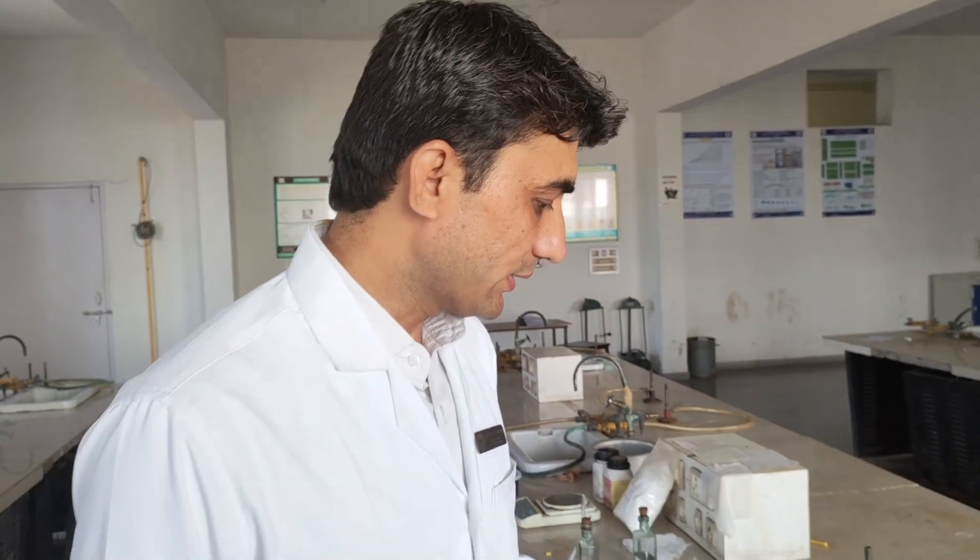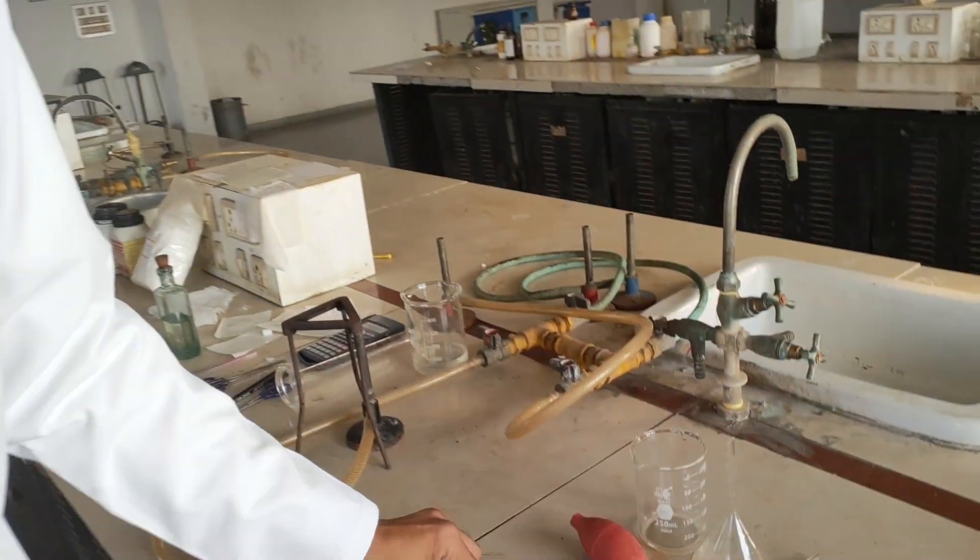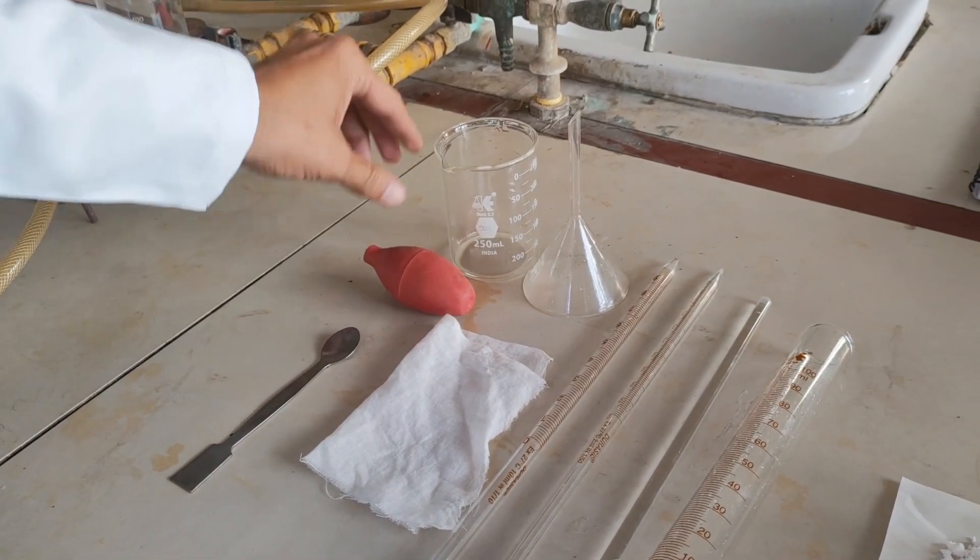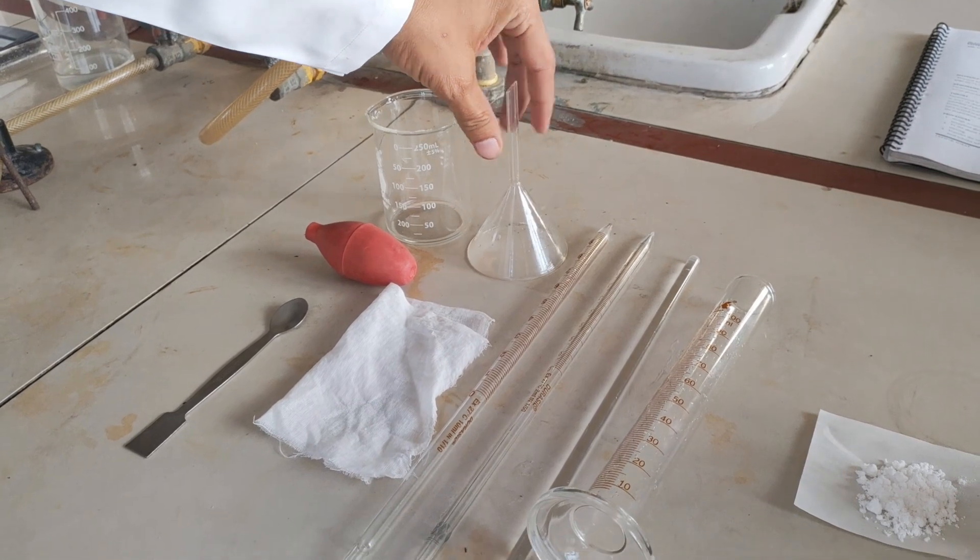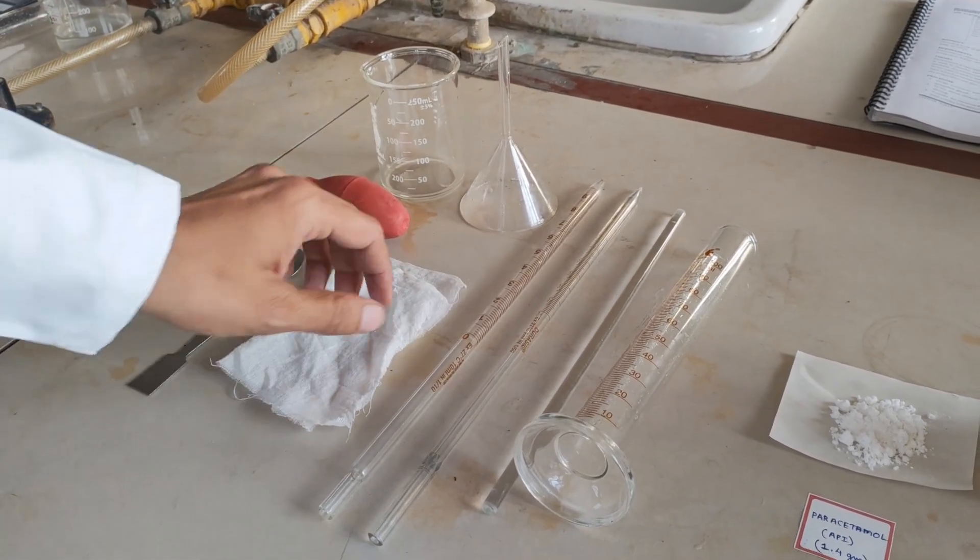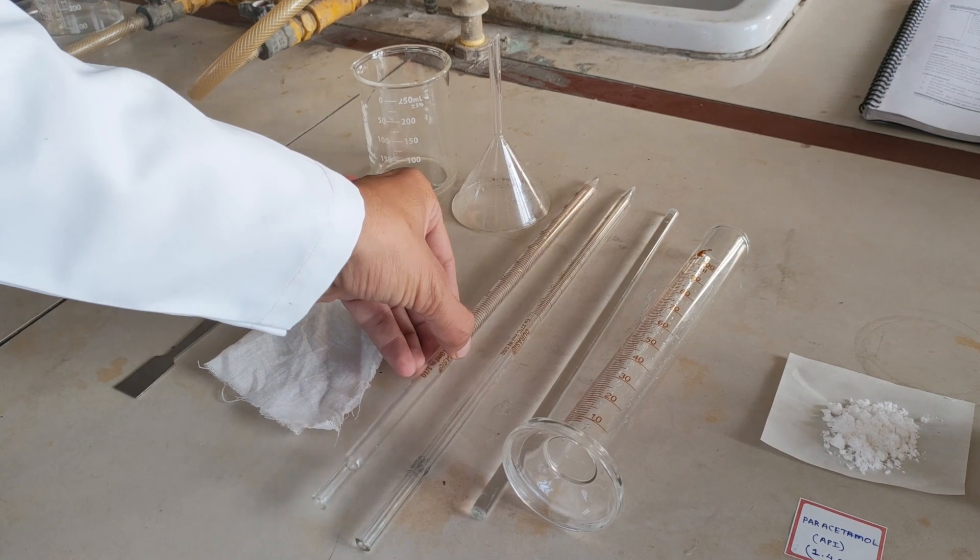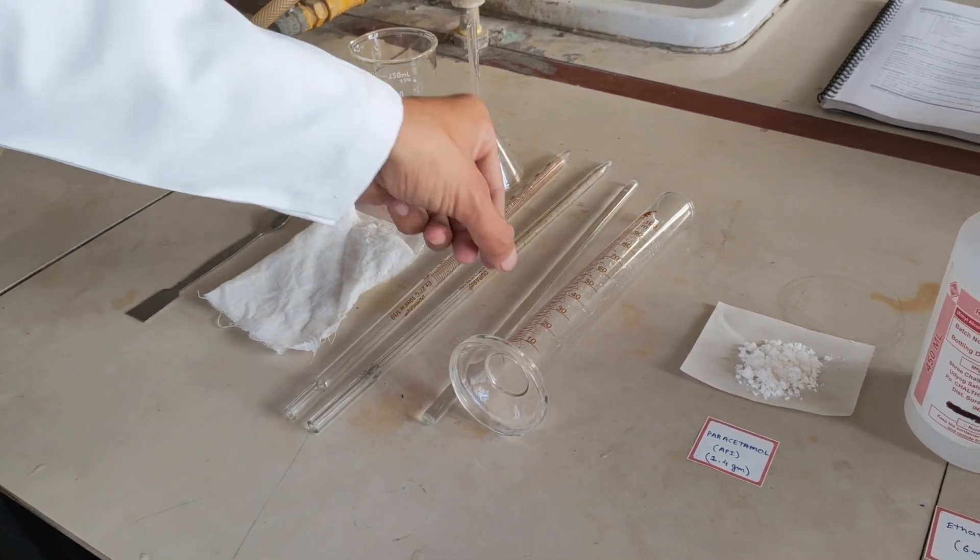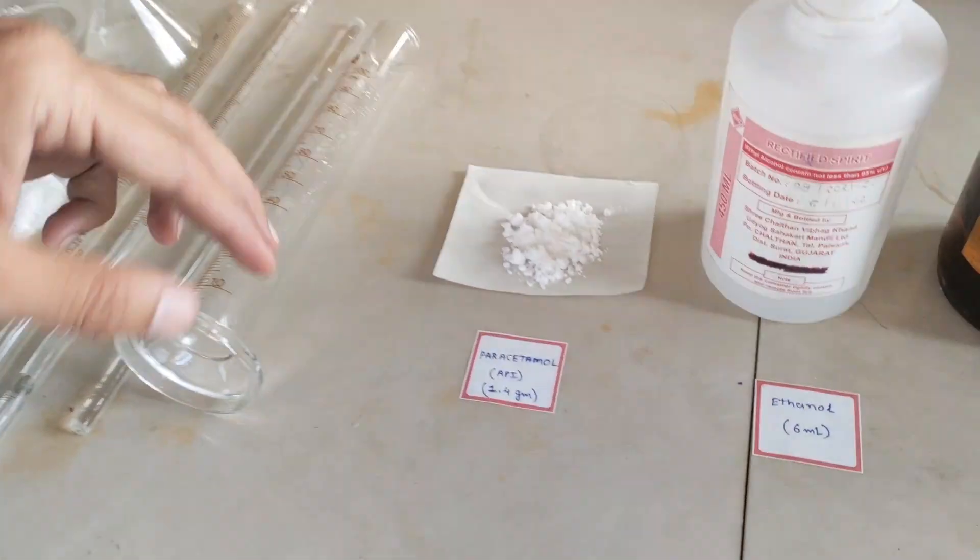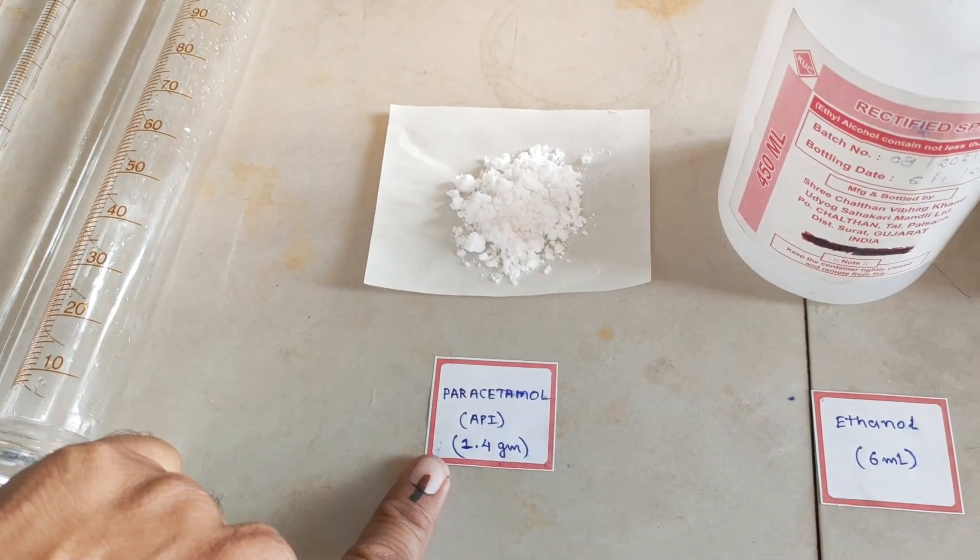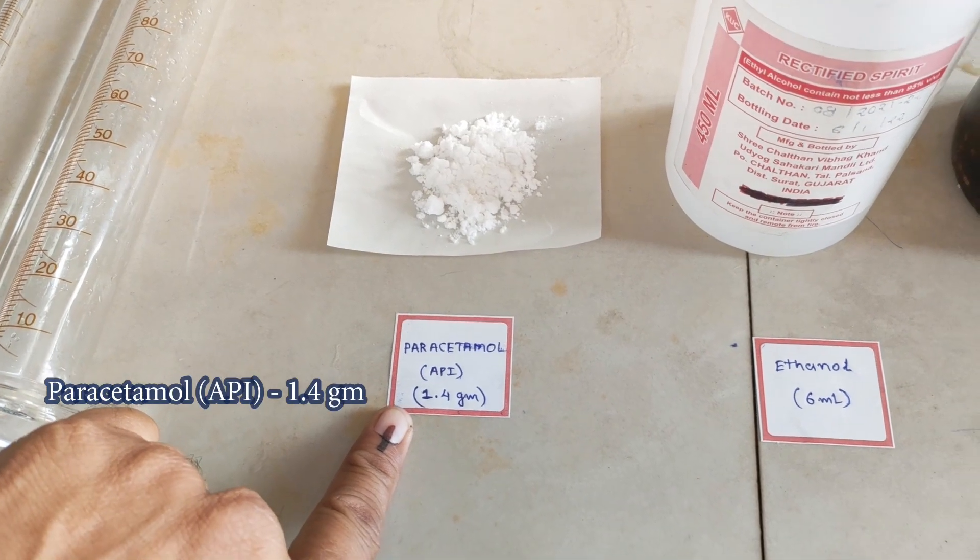Welcome everyone, today we are going to prepare paracetamol pediatric elixir. For this formulation we require spatula, beaker, funnel, muslin cloth, pipette 10ml, pipette 1ml, glass rod, measuring cylinder. Chemicals we require: paracetamol API pure drug.